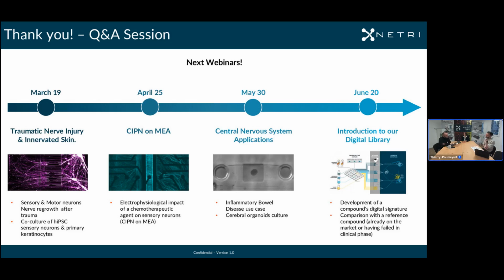Is it possible to cut the chip to perform histology analysis? If yes, did you already do that?